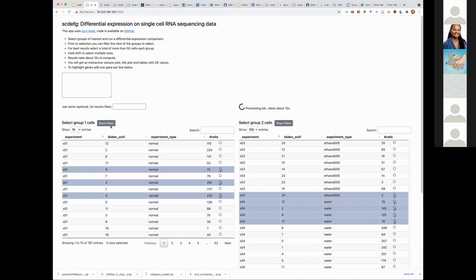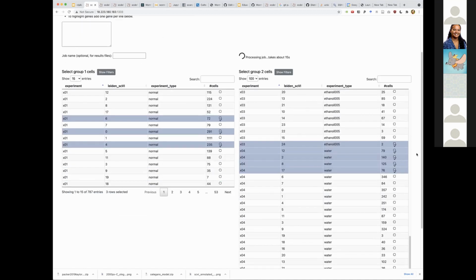And so here you see that the clusters don't have names because they haven't labeled the cells yet, because it's a different stage of development. And so I just gave them the cluster ID, and the biologists are the ones that have the domain knowledge to know how it makes sense to annotate the data. And so I just want to show you.